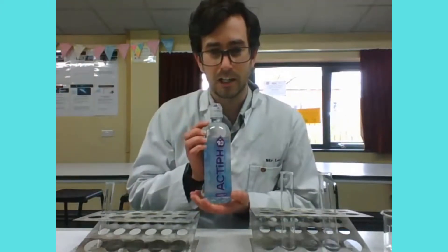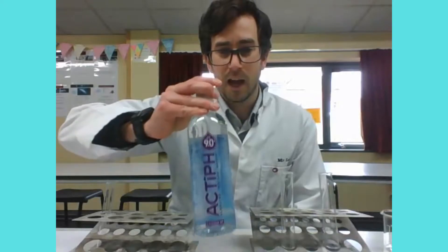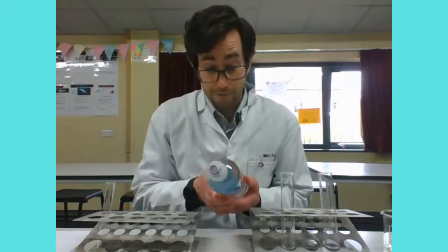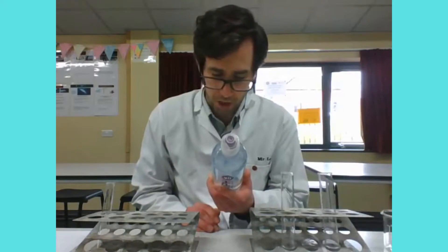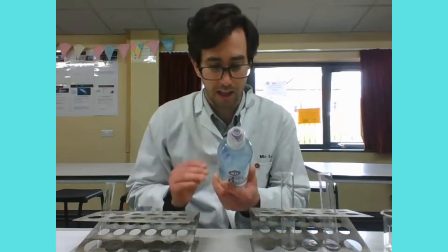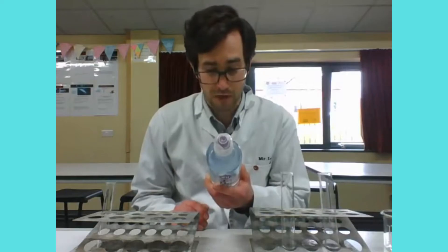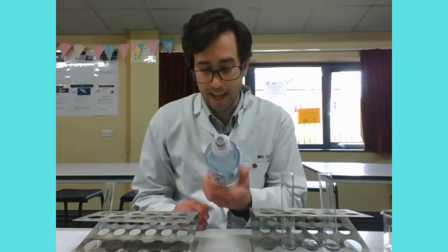So this is a bottle of that water that one of them very kindly brought in for me, and as you can see it says pH 9 on it. What I want to do in this video is actually test to see whether or not it does what it says on the bottle. Looking at the ingredients: Acti pH is ionized water supercharged to pH 9.0 plus, giving it a clean smooth alkaline taste. It's made from purified spring water with a unique blend of electrolytes — sodium, potassium, and magnesium.